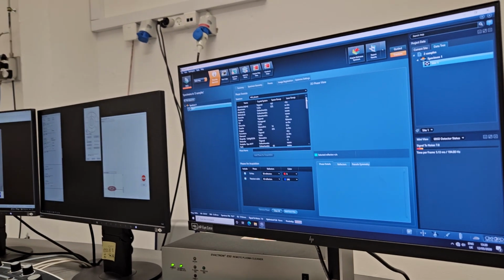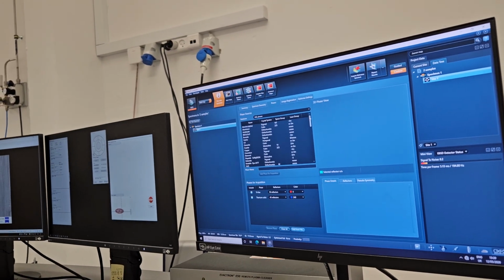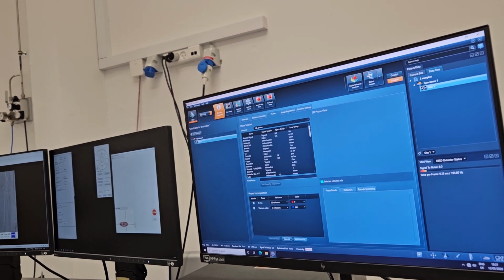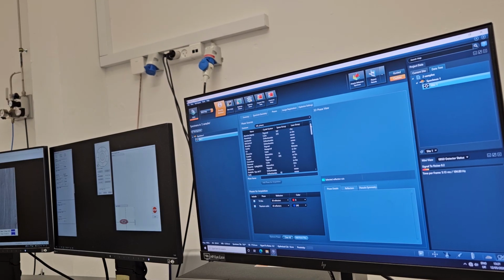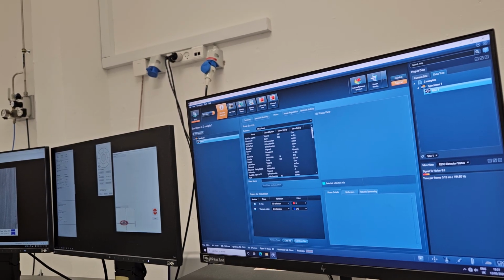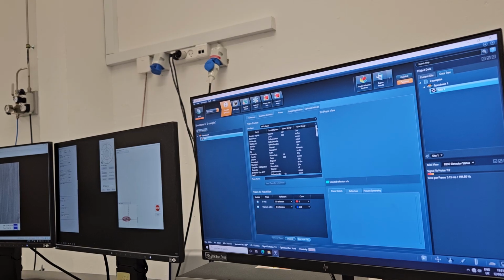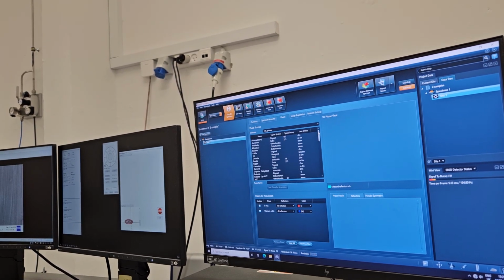Because in the other microscope in Mexico, you can, for instance, have only one phase, and then you can add some others when you have saved the patterns. In this case, you can do phases, but we don't save the patterns. Ah, okay. So if you don't have it in the beginning, then it's not possible to do it later. Our maps are usually pretty big, like millions of pixels. And for every night session, we would have to buy a new drive.